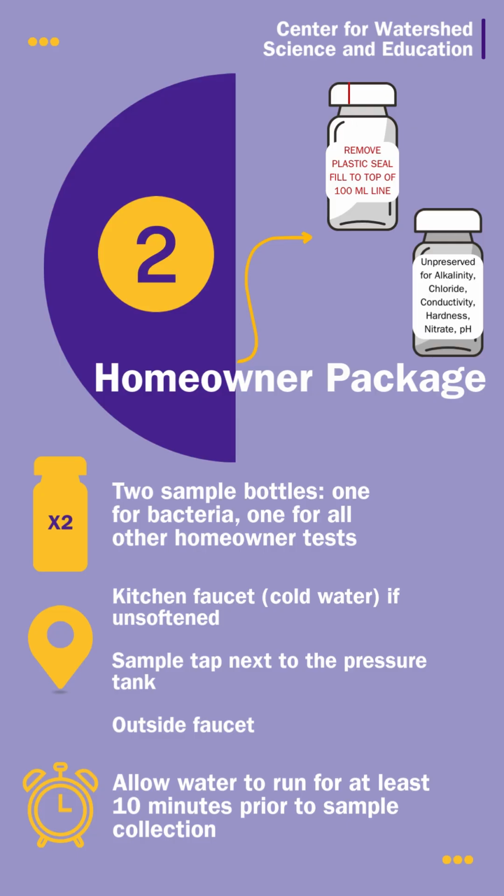To ensure that you are collecting water directly from the well, flush the water for at least 10 minutes prior to collecting the sample. This will flush any stagnant water in the system.